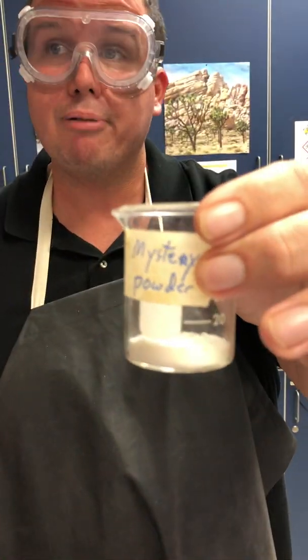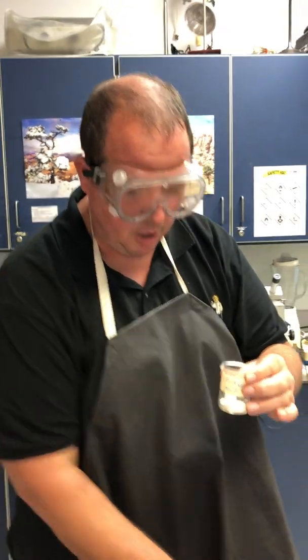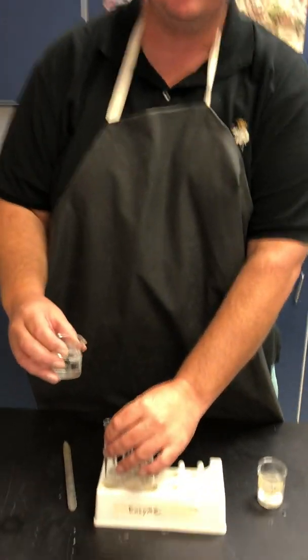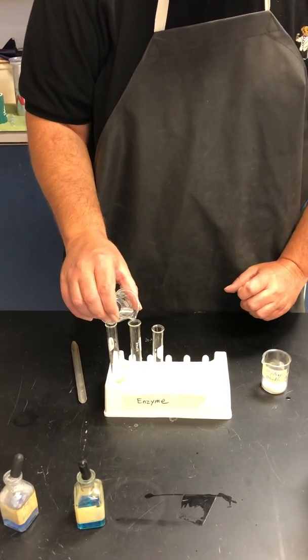In proper scientific ways, we don't dip a finger in and taste it, because you don't know what chemicals are in here. What could be in there? So what I'm going to do is first pour a little water into each of these so that it doesn't stick. I've learned that the hard way too, because it makes a big chalky mess at the bottom.